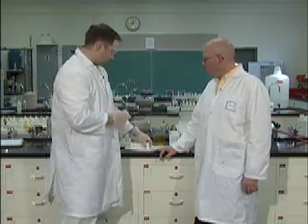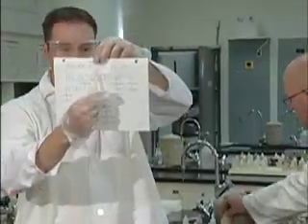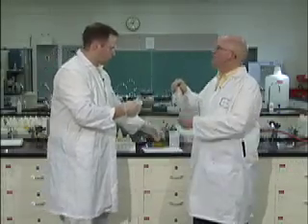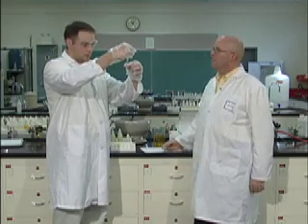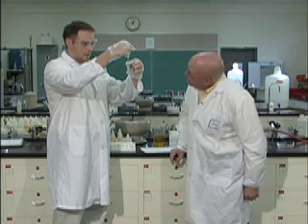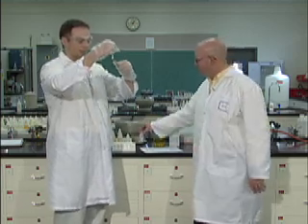And to that, to our unknown, according to our flow chart, we are going to add hydrochloric acid. This looks like hydrochloric. Do you want this one? That is the one I would like. Thank you very much. Okay, now with these, it's really important that you make note of every step that's happening, okay? And it's also really important that you put your lids back on the proper containers. It's amazing at the different results you can get if you put your lids back on the wrong container.